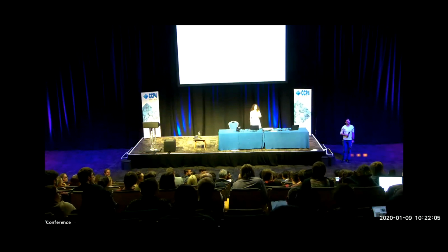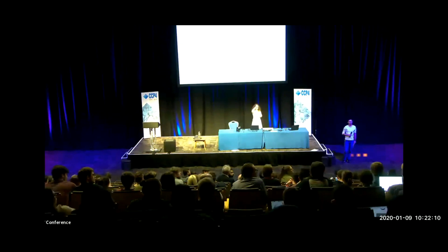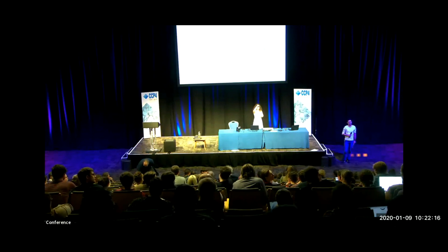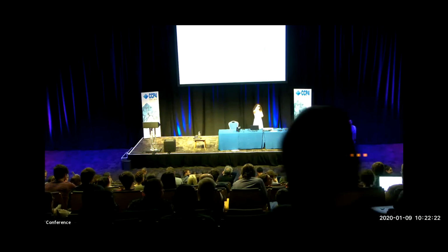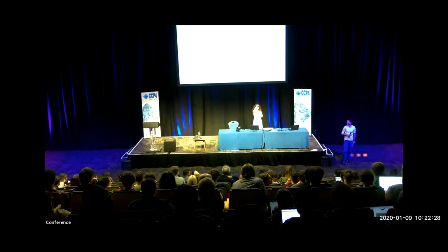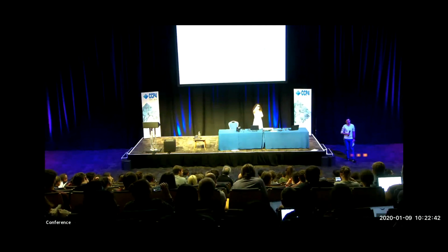Yes, well done for getting back to first principles in refinement. Just for the record of history, some of you, maybe very few of you, may remember that the first refinement program for proteins was Bob Diamond's real space refinement program, published in 1971, which economized on parameters using exactly that idea. Because at the time, you had to do refinements on machines that had a small fraction of a megabyte of main memory. So well done for taking this up again.